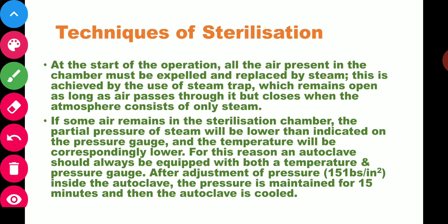After adjustment of pressure to 15 lbs per square inch inside the autoclave, the pressure is maintained for 15 minutes and then the autoclave is cooled.